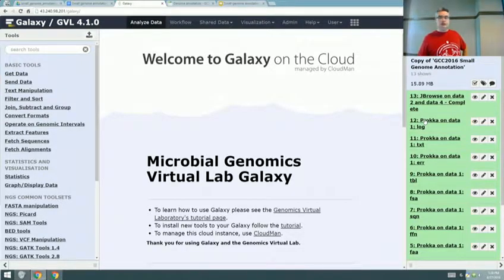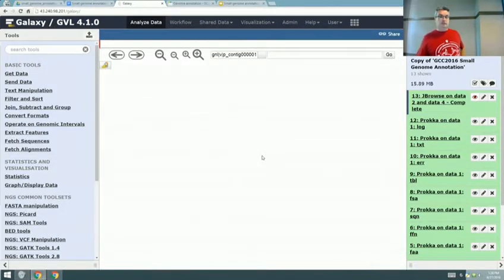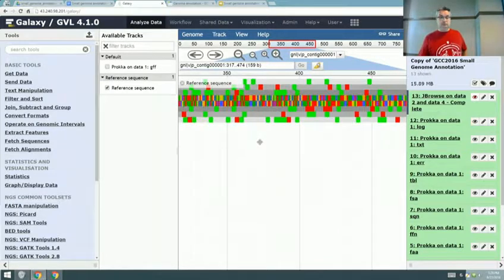There's a classic option and a track that'll take it back. We want to see where the coding region is, which of the reading frames is the coding one, when you click and it says this is the protein product. Which one of the reading frames are they talking about? It tells you in the annotation, but you don't know. I want to see it overlaid on the coding region, or even just make it a different color, like Artemis. Don't worry, I'll write to them.